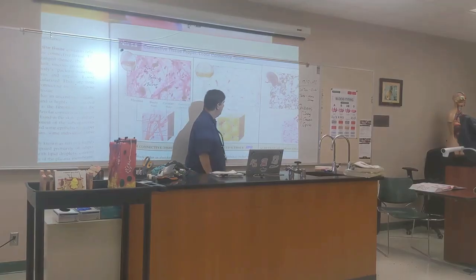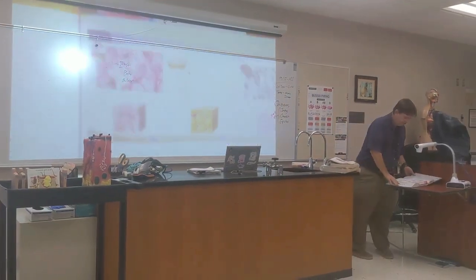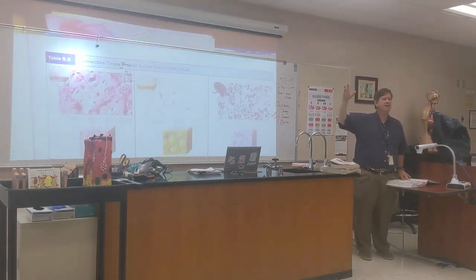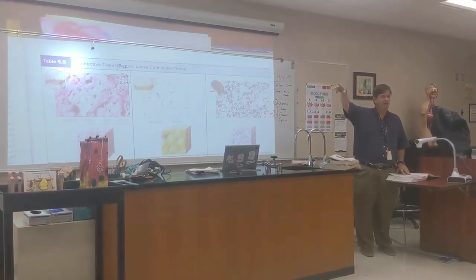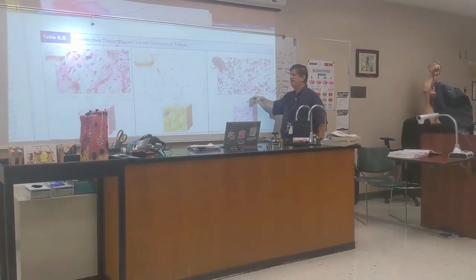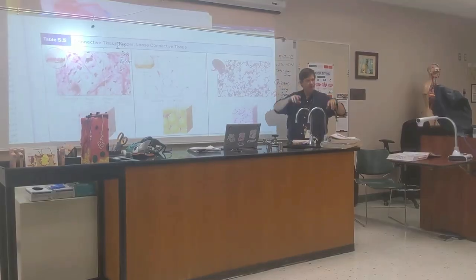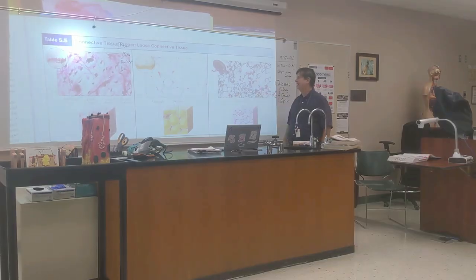Okay. Now this is reticular fiber. I told you that there were three types of fibers. You may remember the three types of fibers. I said three main types of fibers: collagen, reticular, and elastin, yes? Okay? So this has a lot of reticular fibers. Those are made out of collagen, but they're really fine, diffuse, spread out. They're the scaffolding that these white blood cells are crawling around on, hanging out on.